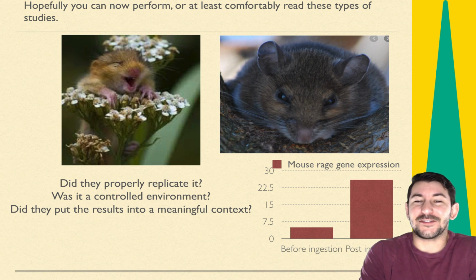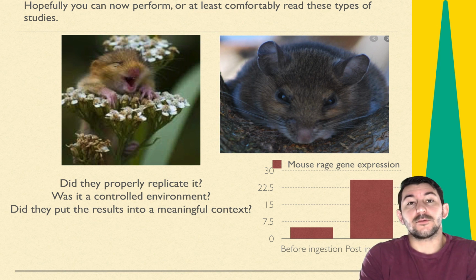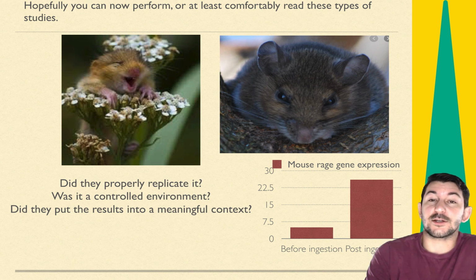And when you read a paper with RNA-seq results and they say the genes were more highly expressed, you need to stop and think, no, we're scientists, we need to be a little bit more specific. They might be in a higher concentration, but we don't have the information to say that they're more highly expressed.